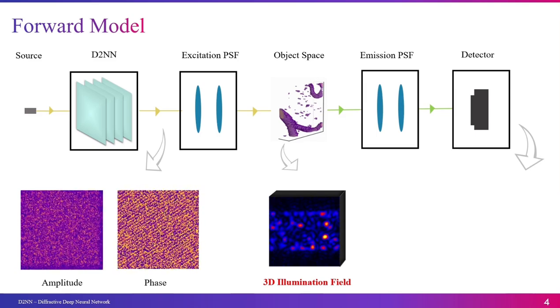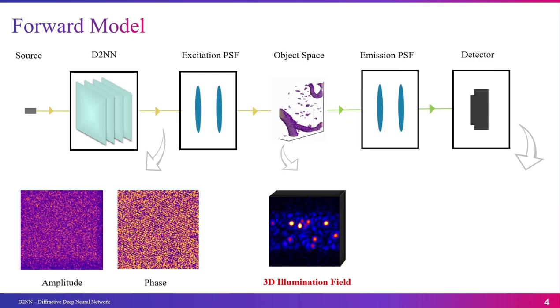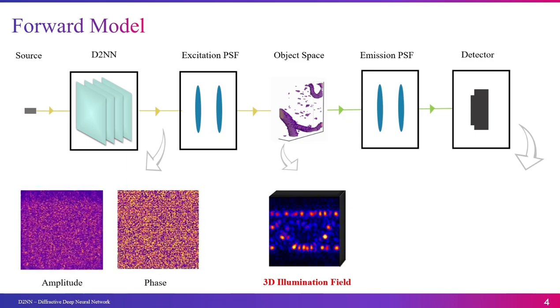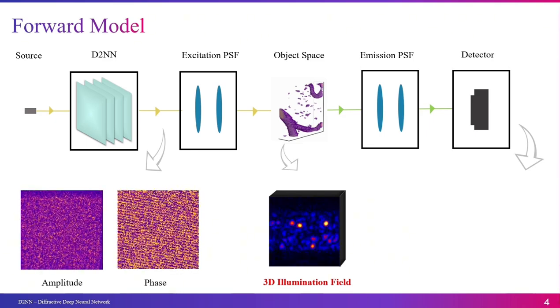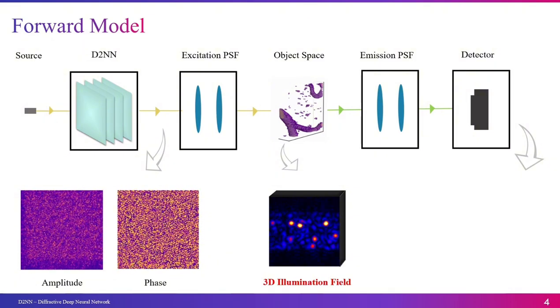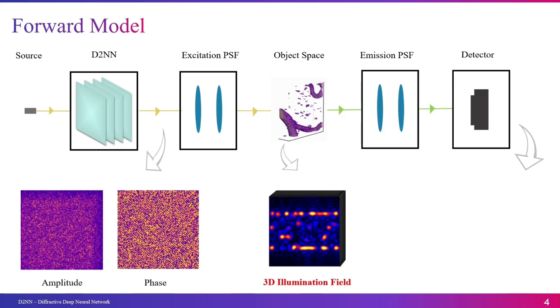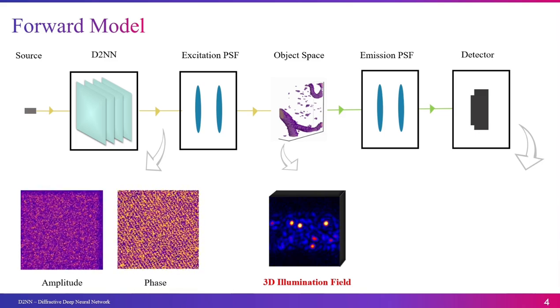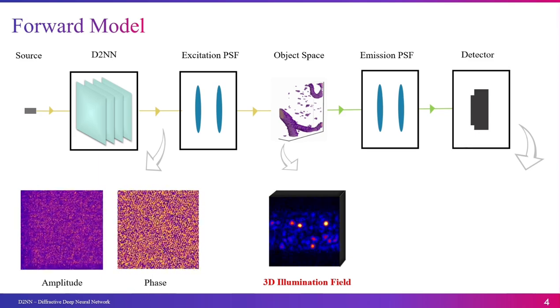The forward model also considers detector limitations such as lower resolution and noise, ensuring a comprehensive depiction of the imaging process. By combining these multiple 2D images, we can reconstruct a detailed 3D model at the desired resolution. This approach is crucial for efficiently imaging complex structures, overcoming the limitations of single measurements, and ensuring we have enough data to build high-resolution 3D images.